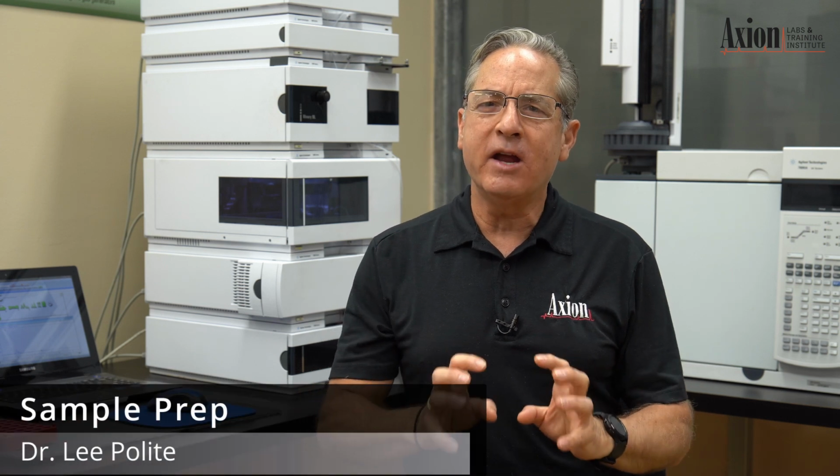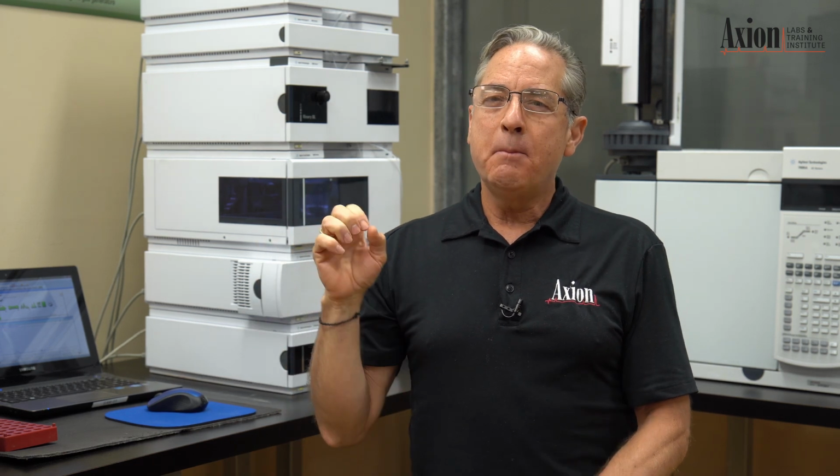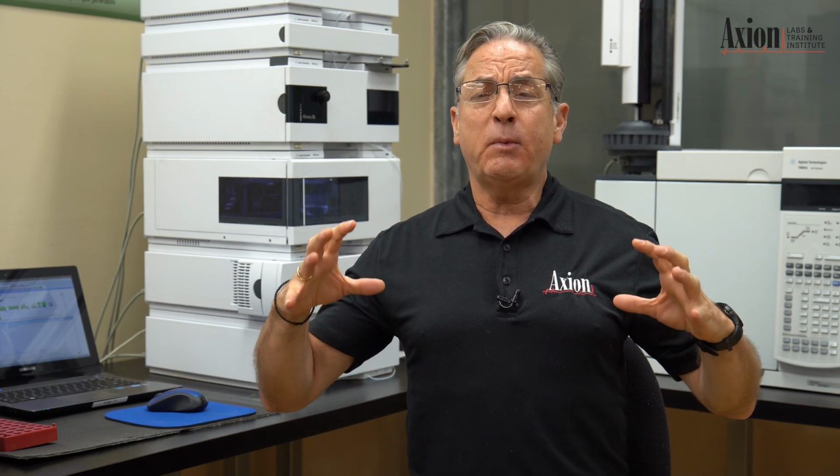Let's talk about sample prep, because this is where most of the errors occur in the entire analytical procedure. We call this pre-analytical error, and those are errors that happen before we get to the instrument. We could measure the precision, the accuracy, we could measure the carryover on the instrument, but what we really want to talk about is where the errors occur, and that is when we're dissolving the sample, filtering the sample, and working with the sample.